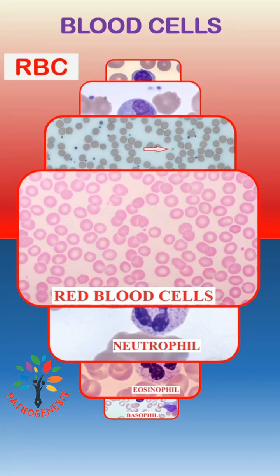There is no nucleus in the red blood cells. Cytoplasm is pink with less main stain. It shows central pallor.